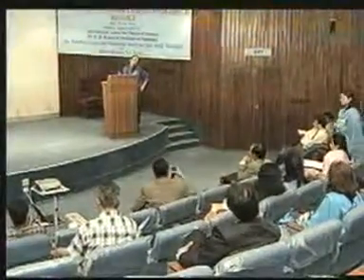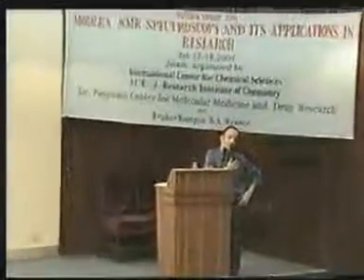If you look at the sites in the world which have invested in 800 and 900, these are sites mostly involved with biostructure analysis and protein structure determination, what we now call proteomics. For example, in Japan, there is this RIKEN center where they have installed, I think, six 800 megahertz systems, just to produce protein structures.